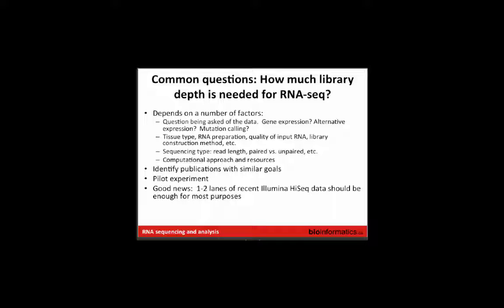But if you want to do alternative expression analysis, or you want to call mutations from your data, or you want to look at RNA editing, then that same calculation doesn't apply. You need to adjust your expectations. Can you give us like a ballpark number?